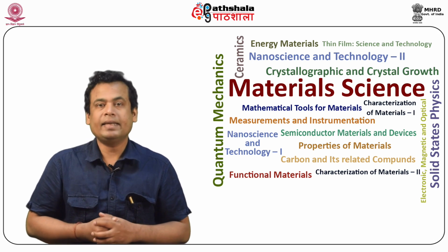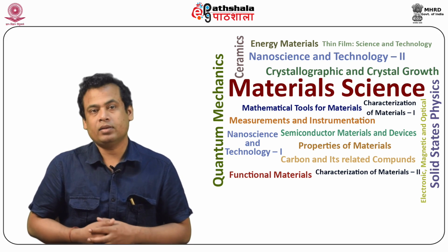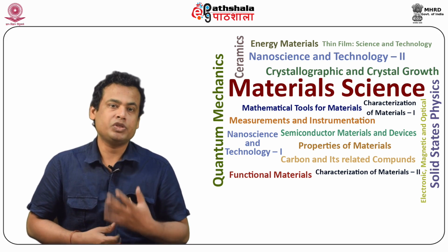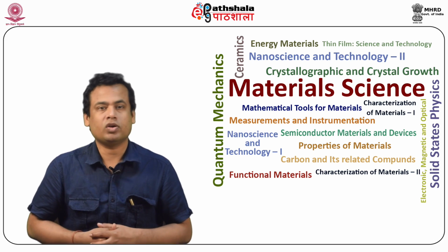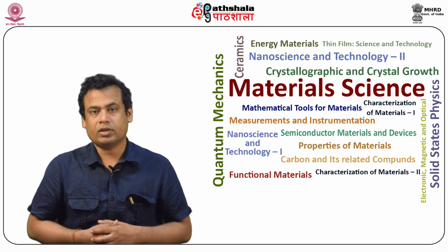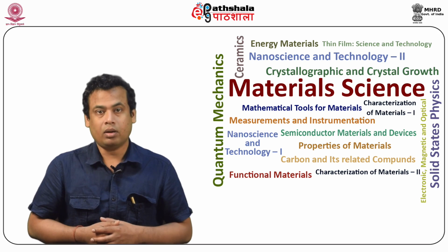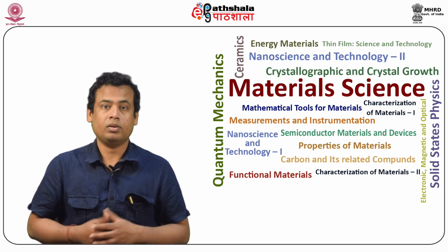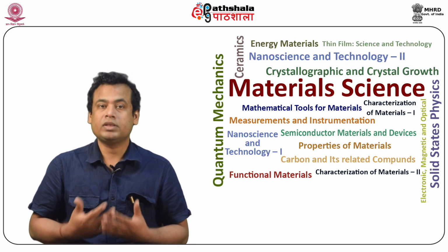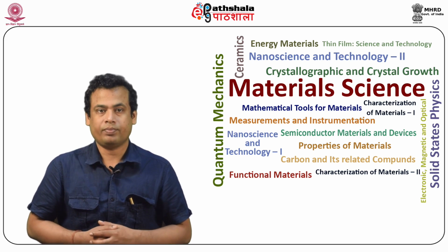The secondary electron coefficient is defined as delta equal to NSE divided by NB, that means the ratio of the number of secondary electrons from the specimen to the number of beam electrons incident on the specimen. The escape depth of the secondary electron is small, a few nanometers, so all of the secondary electrons created by the beam electrons at greater depths are lost.